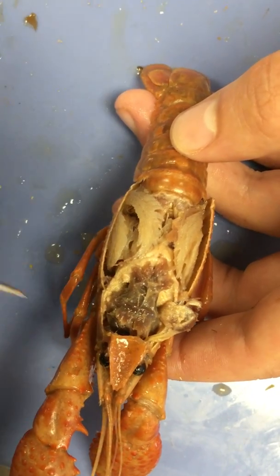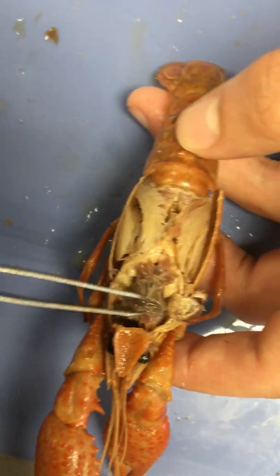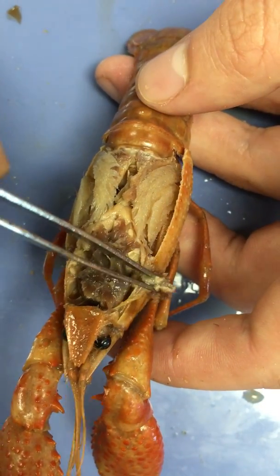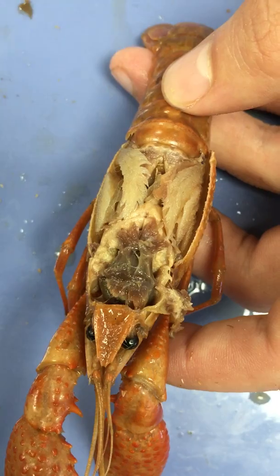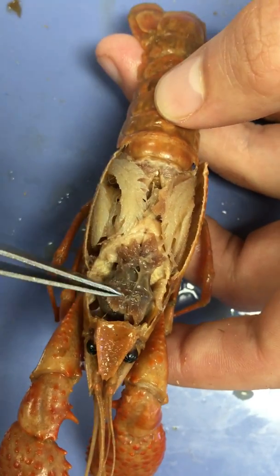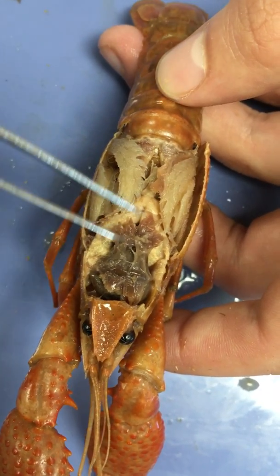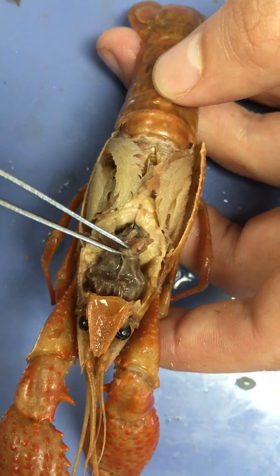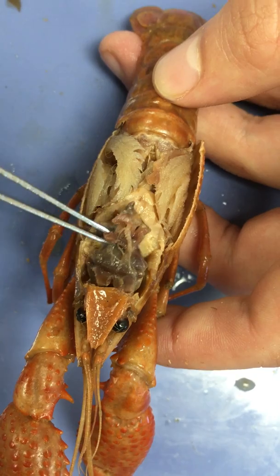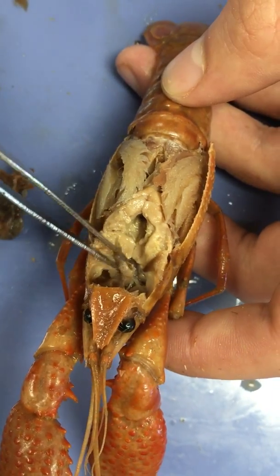Next we come to the stomach. This is the stomach right here — this bag-like structure similar in coloration to the mandibular muscles. Unlike in human beings, the crawfish stomach is located just behind the head. If we work carefully, we can roll the stomach out and pull it out — and there we have the stomach.